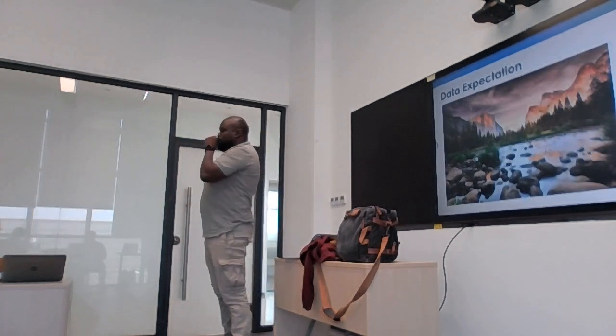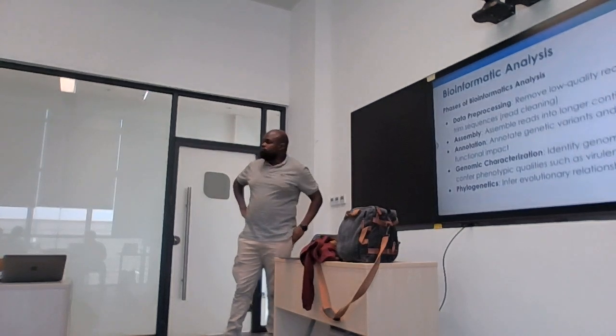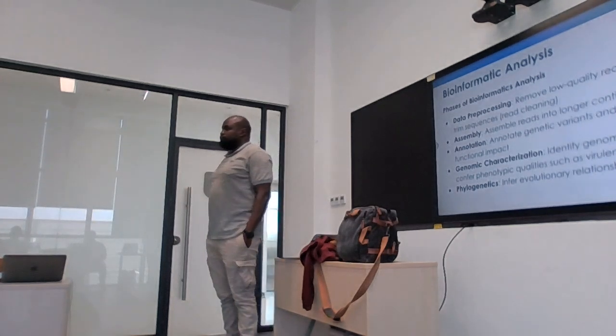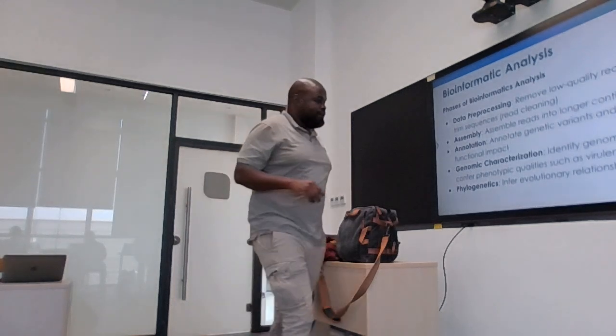I want to ask, about the processing: first you said that the objective is to remove the low quality reads. But then at the end you said that you can trim the sequence. Is it different, or is it trimming sequences? You remove the low quality sequences. Is it a full trimming? Now, they can be independent, but they can also be related. Okay? Let me explain why.